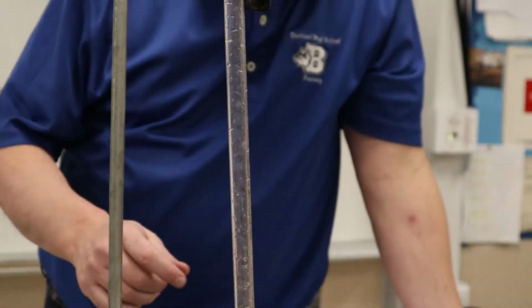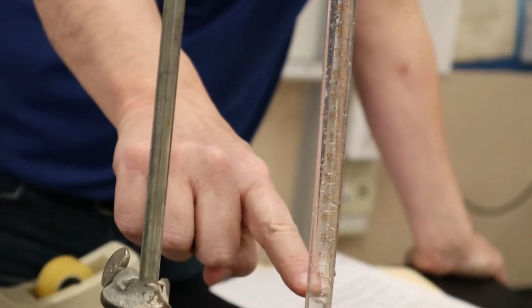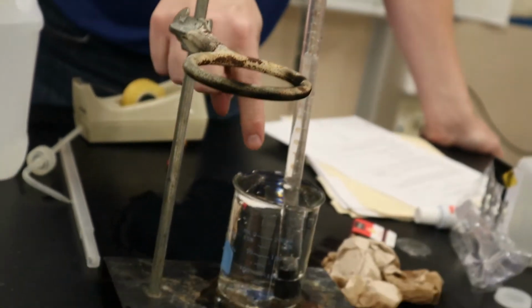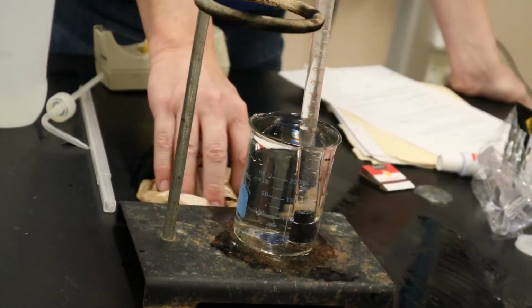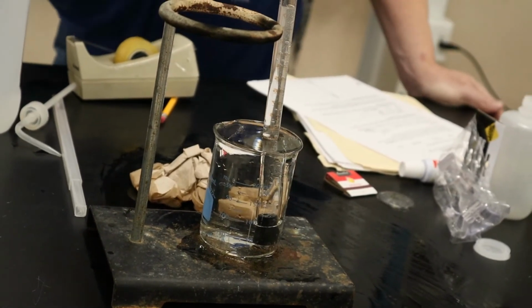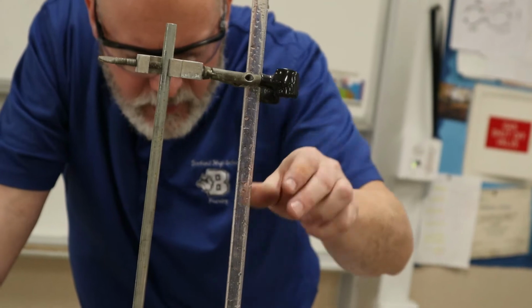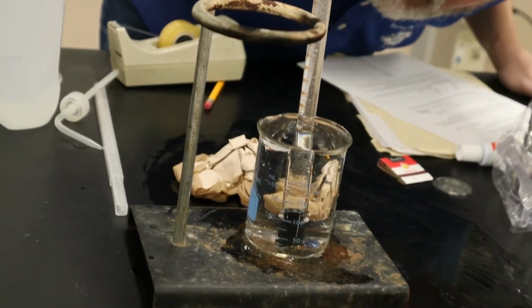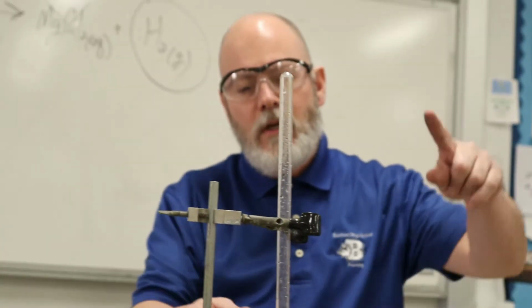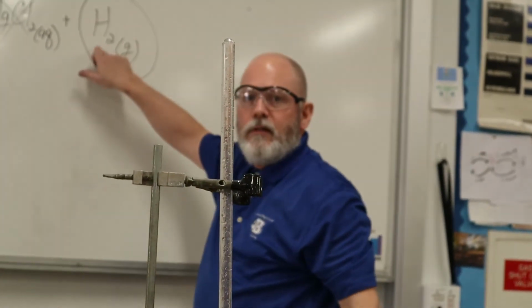Okay. All right, so you can see all of this now is hydrogen gas being collected, and you can see the water level dropped all the way down here because the hydrogen gas was pushing the water out. And then the water entered the beaker here and started overflowing, so that's why we're wiping this. It's still overflowing. We're almost done. Oh, good. I don't see any more bubbling. I'm sorry, I don't see any pieces of magnesium in there, so we're good. Okay, so that's the reaction. So all of this right now is hydrogen gas. So I collected all this hydrogen gas, right? This guy right here.